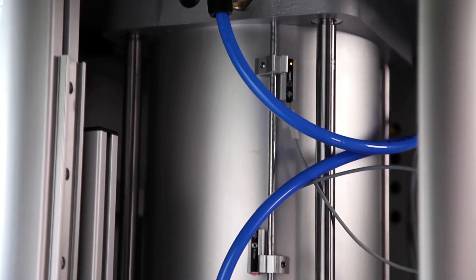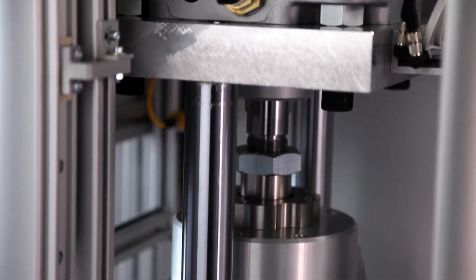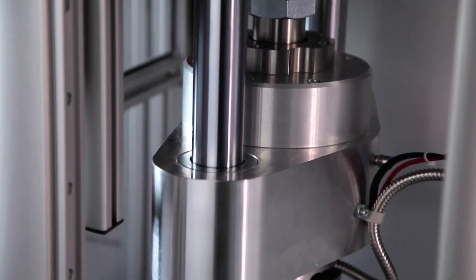The RPA Elite's variable high-pressure pneumatic system guarantees consistent sample history and uniform die sealing.